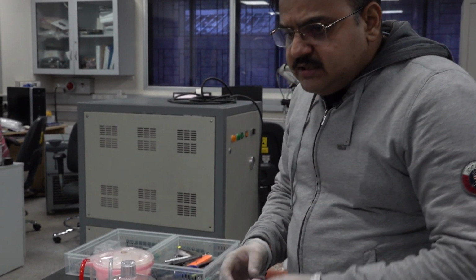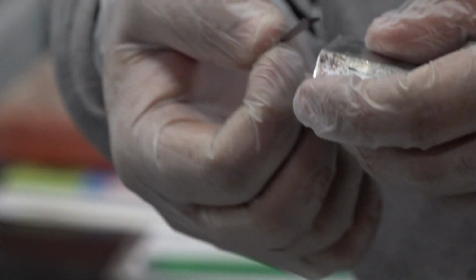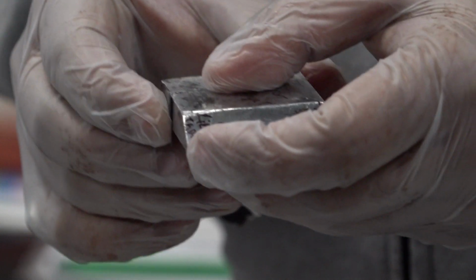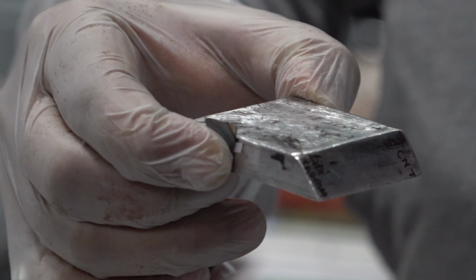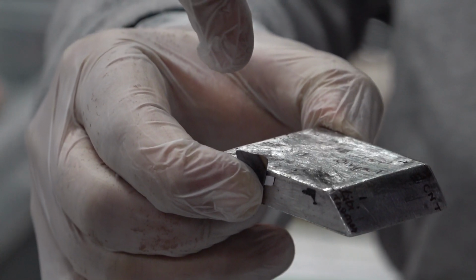The advantage with this kind of stub is, if you want the top surface morphology, you can mount the sample like this. If you want the thin film cross-section, you can mount the sample like this, so you will be able to measure the layer thickness of your thin film.